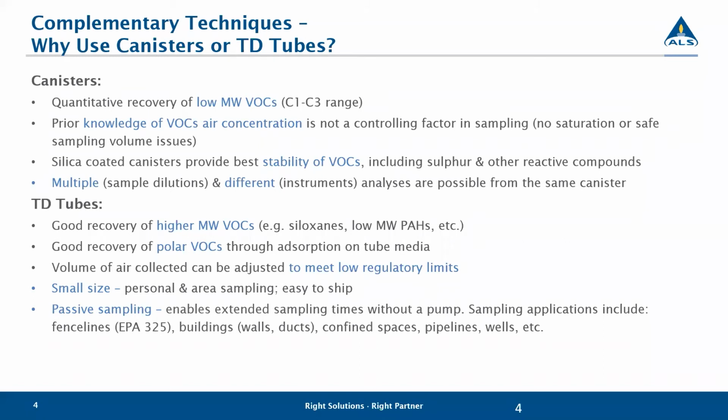allows us to be able to hit the hold times for the sulfur, which is really important. Sulfur, we've gone through the canister studies, and if you're interested in this, we can provide that, we do have a stability for up to 7 days for sulfur compounds in canister.